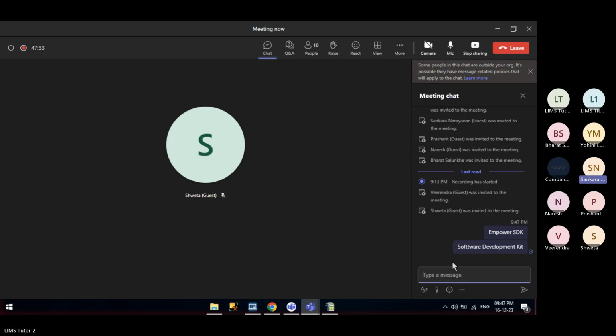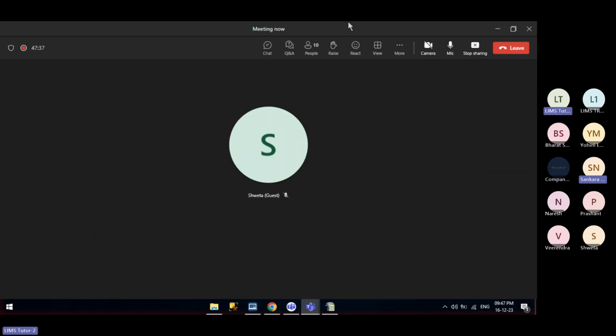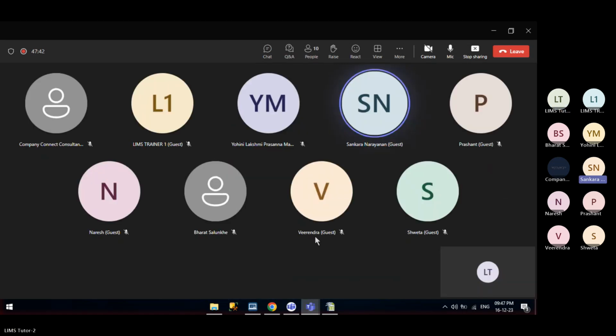My first question, initially I asked two questions. The second question was not answered. I was asking about the configuration of your particular model, and if there are any changes required in the configuration, sample management, lot management. Will you explain that configuration changes flow also, or how do you explain that?